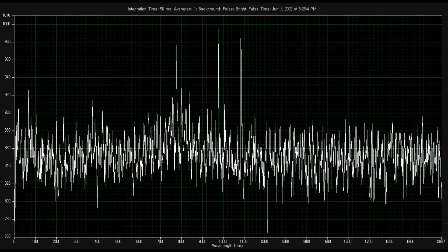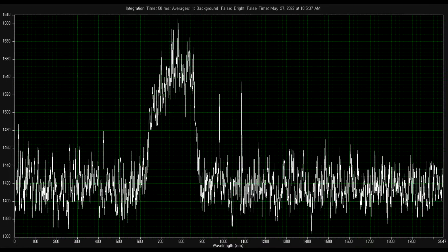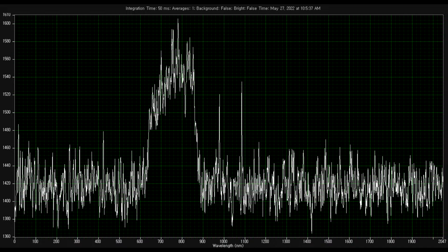When I finally wanted to use it as a spectrometer, I noticed that the spectrum is absolutely wrong. No matter what kind of light source I put on to measure, it always ranges from 600 nanometers to 900 nanometers.